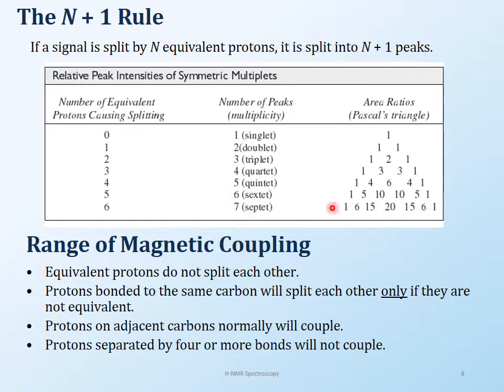It's beautiful. When you see a 7 in the NMR, it's very clear that you have 6 protons. There is nothing else that is going to give that kind of splitting when you see a septet. Septets and quintets are really fun to see because they're very symmetrical and very pretty to look at. Okay, so that is how you would see the splitting that goes on.